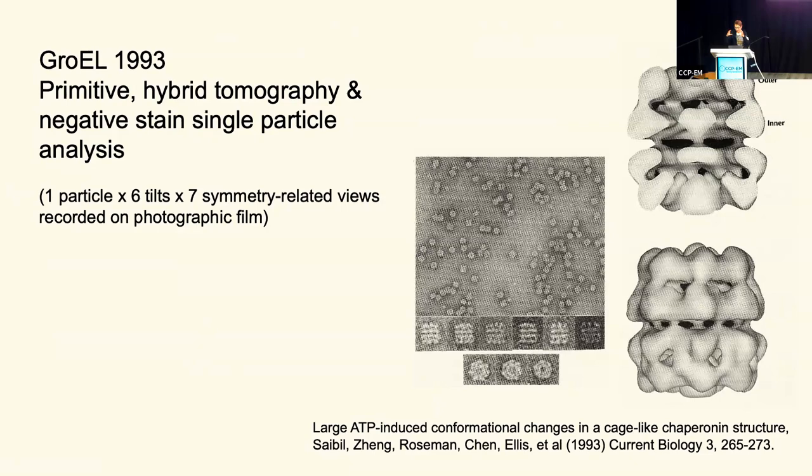It showed us that the molecule had a cage-like structure, and there were spaces inside, because we had no idea. So that was pretty exciting, because in the original models we thought the subunits were C-shaped, but they were sticking outwards, so they were like back to back, but it's not true. They're cavity to cavity, and that creates spaces inside these 2 rings of 7 subunits. So that was the first time we saw that. So I thought, people may think I'm nuts, but this is interesting.